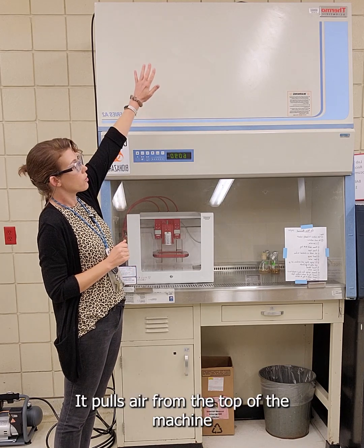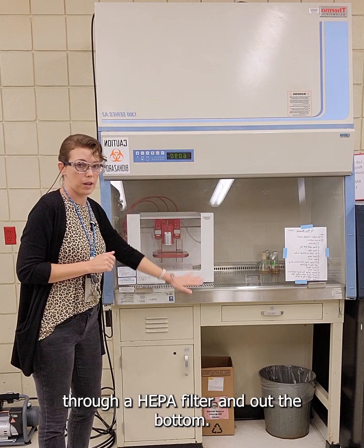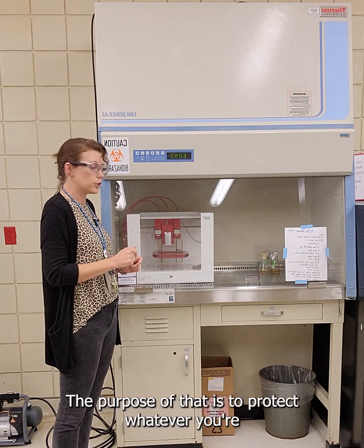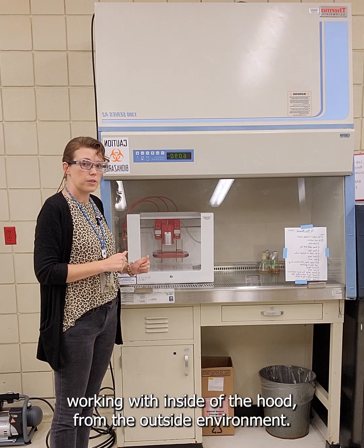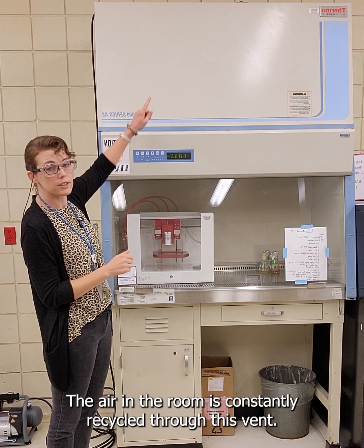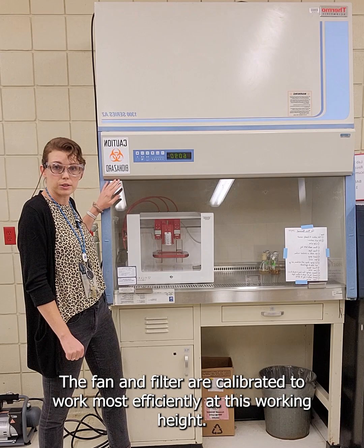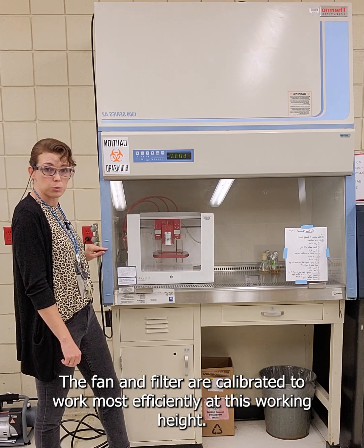It pulls air from the top of the machine through a HEPA filter and out the bottom. The purpose of that is to protect whatever you're working with inside of the hood from the outside environment. The air in the room is constantly recycled through this vent. The fan and filter are calibrated to work most efficiently at this working height.